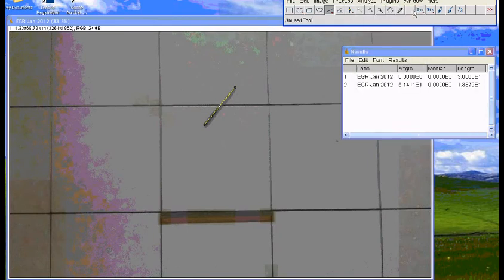What you need to do is go to Analyze. You may either click on Measure here, or you use a shortcut key called Control M. Click on here. It's 13.379. Well, if you're not satisfied with it, you want to measure again. You click again, drag it up to here maybe. I press Control M, and it turns out that, oh okay, 13.36, which appears to be quite accurate because the length of this pen is actually about 14 centimeter.